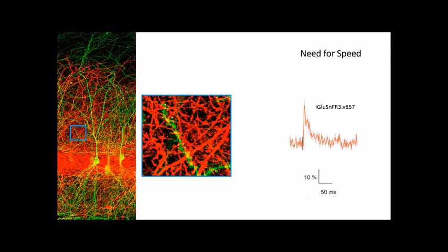Okay, so it's been almost an hour, but I do want to talk to you about microscopy as well. The recordings that I've shown you are all of little tiny segments of neurons, dendrites, or axons at any given time. As Darcy alluded to already, there's a lot that we can learn from those types of experiments, and we're super excited to give this indicator to many labs to do, for example, mapping of dendritic inputs, a little patch at a time on neurons.